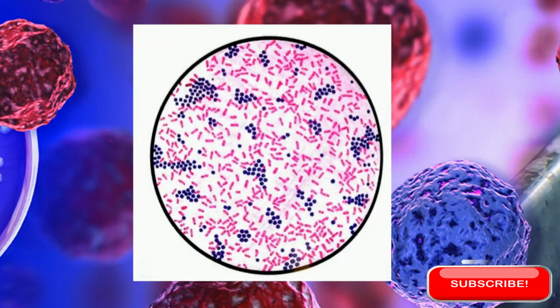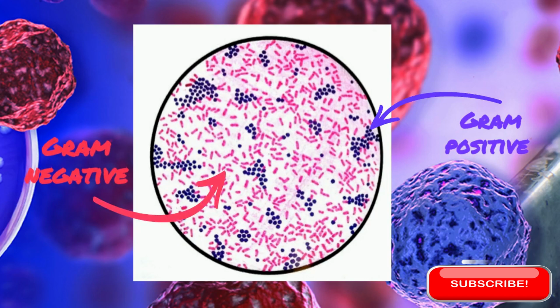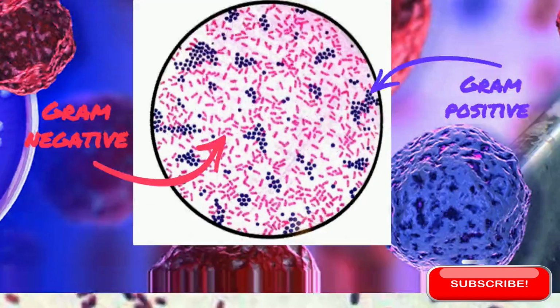When the slide is studied microscopically, cells that absorb crystal violet and hold on to it will appear purple. These are called gram-positive organisms. However, if the crystal violet is washed off by the decolorizer, these cells will absorb the safranin and appear red. These are called gram-negative organisms.